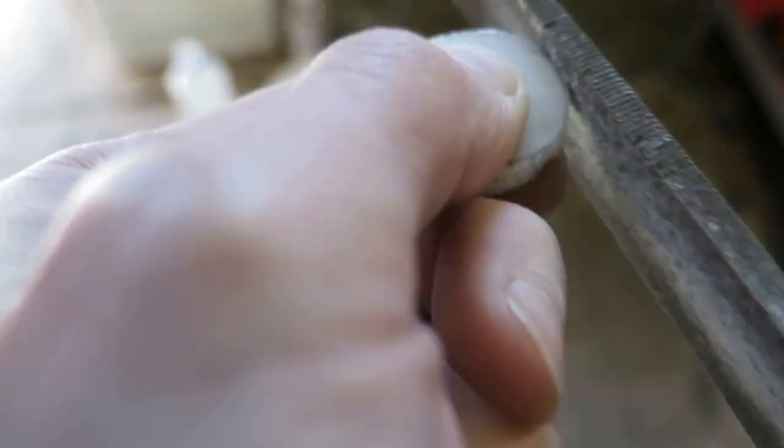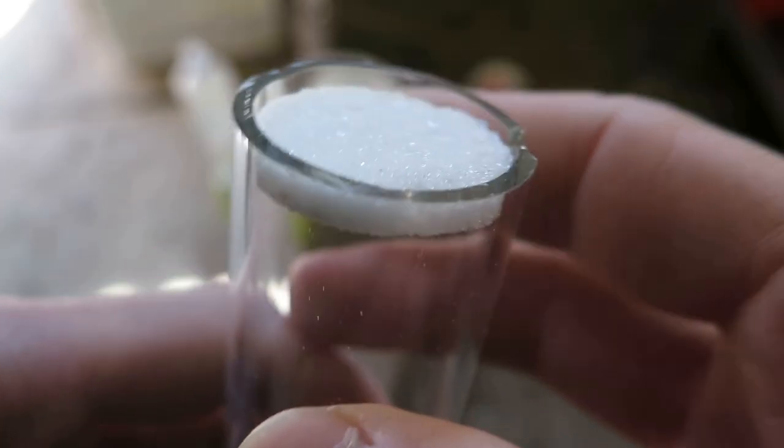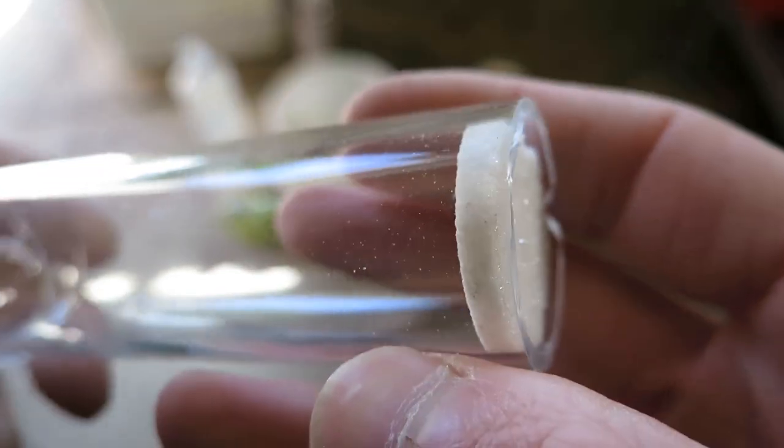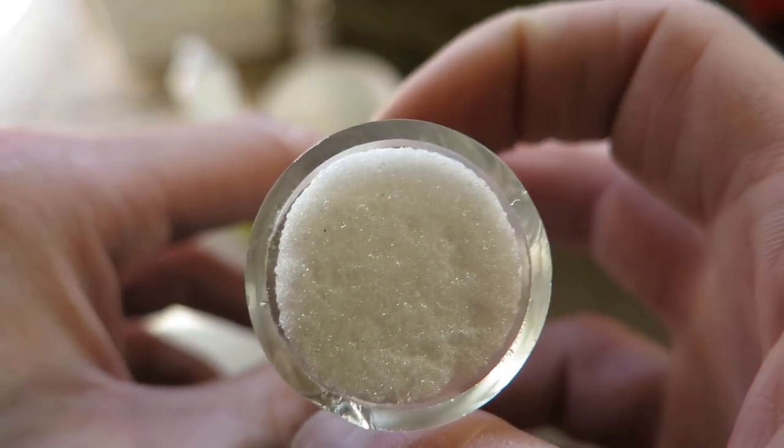To check if I can actually process this with my torch, I formed a circle using a file. I can feel that the structure is not quite uniform, but what can you do. Anyway, it fits relatively nicely into the tube.